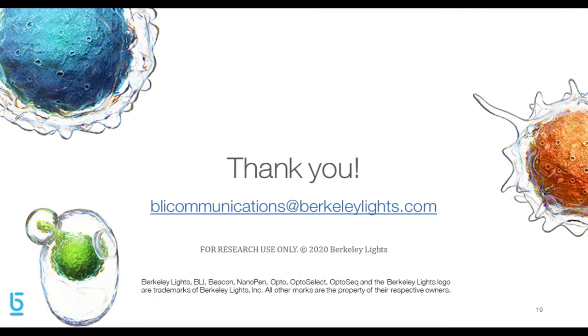Are all surface proteins, do they induce antibodies? So we're able to screen any sample from an immunized animal or human in which there has been an immune response.